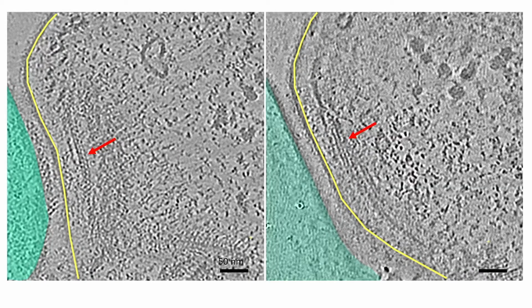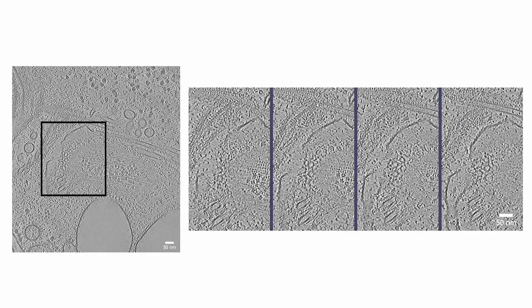Here, just for you to see, I picked two different types of filament at the entrance of the flagella pocket. Here we have a helical shape filament, and here a more straight filament. So there are different types of filaments in this region. And I wonder if this is a clathrin lattice. Maybe John can say if this is a clathrin lattice.